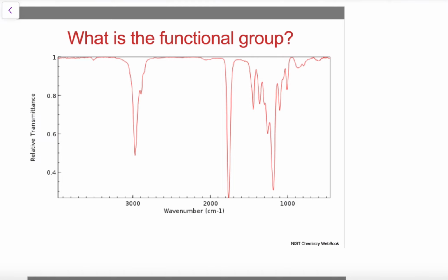All right, what about this spectra? What sticks out? Well, again, typically, look for the carbonyl. We have this huge peak at around 1720, so that's suggesting carbonyl. Now, then we can look for OH stretches or NH stretches over to the left, or around 3000 before it. There's no apparent OH or NH stretch. What other peaks do we have? Well, around 1300 here, we have a CO stretch.